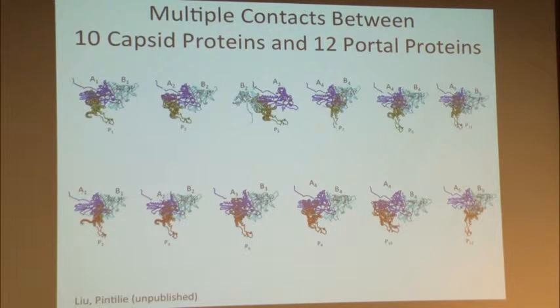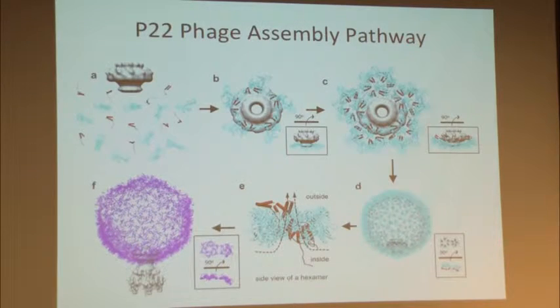So I think this monomer interaction you cannot derive from crystallography of the protein alone. In fact, the crystal structure of this particular portal protein was done. But the crystal structure alone could not tell you what types of interaction, what domain, who is next to whom, and where. So I think EM will provide you this information. With all these things I described, we can provide an assembly mechanism. First, this particular portal, 12 copies of it, forms a nucleating site to have some scaffolding protein surrounding it, build additional capsid protein around it, and then more and more, and eventually build the whole capsid.